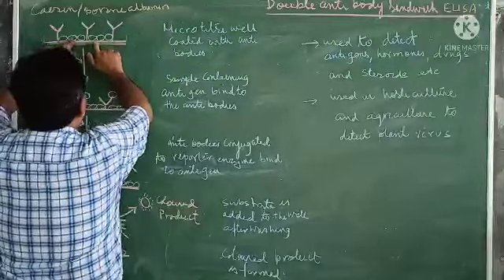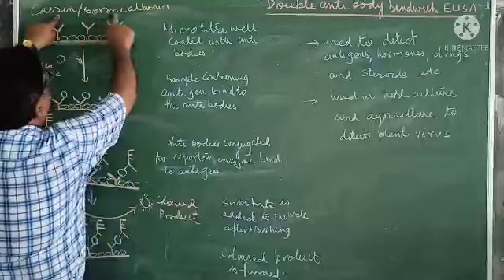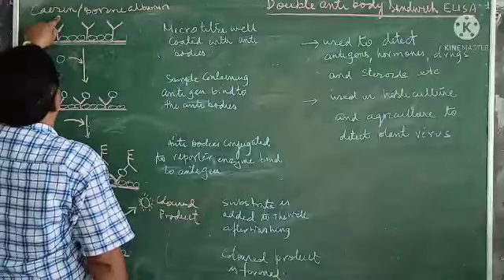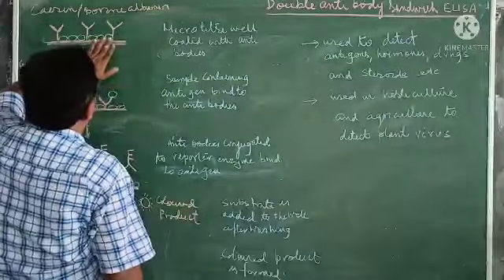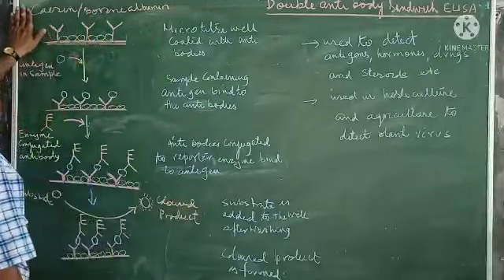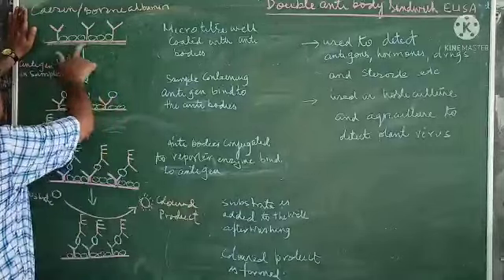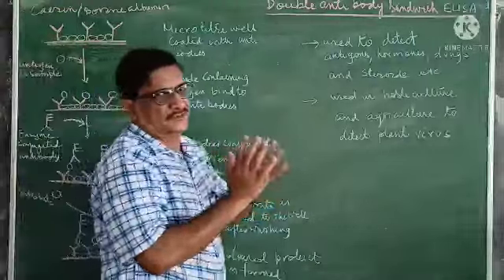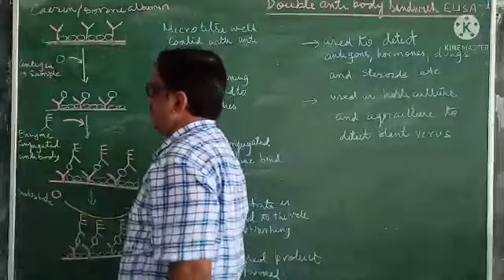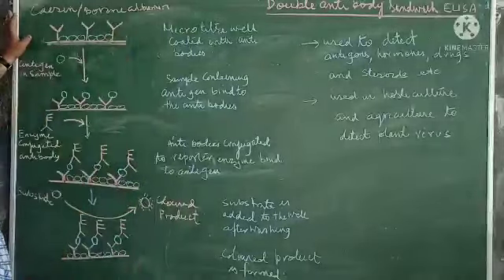This exposed surface is covered with neutral, inactive, non-reactive compounds like casein or bovine albumin. Binding of these non-reactive molecules prevents any undesired antigen from binding to this surface and interfering with the result of the experiment. So this is the first step.